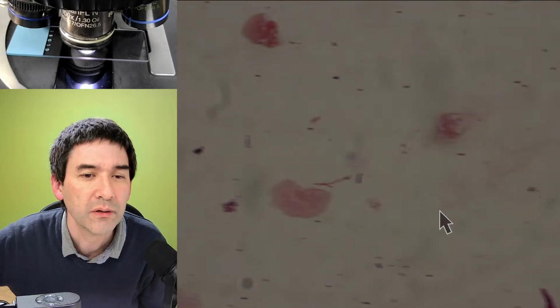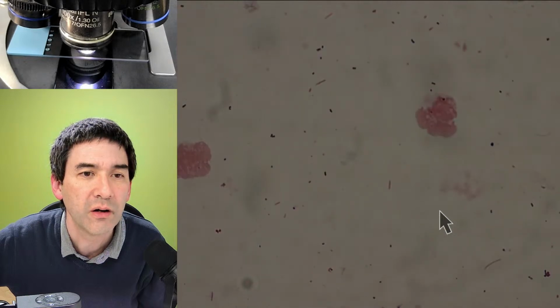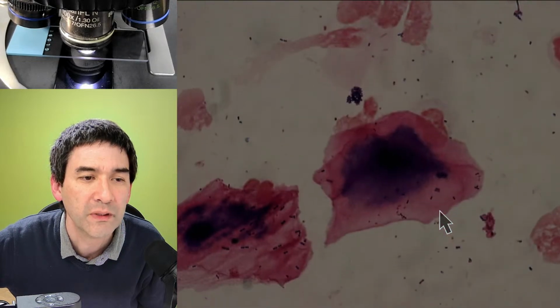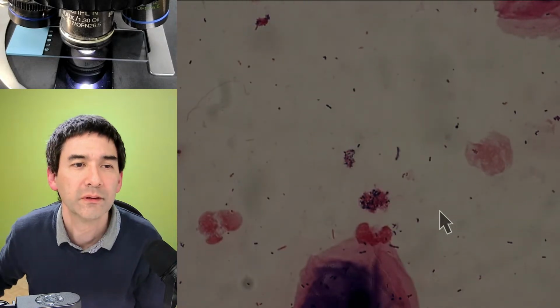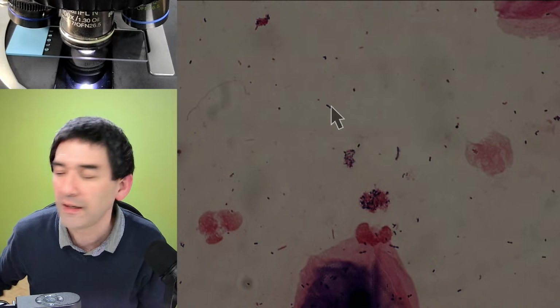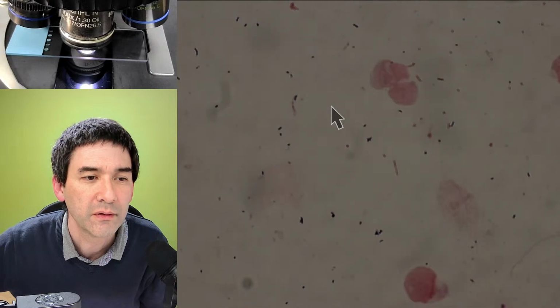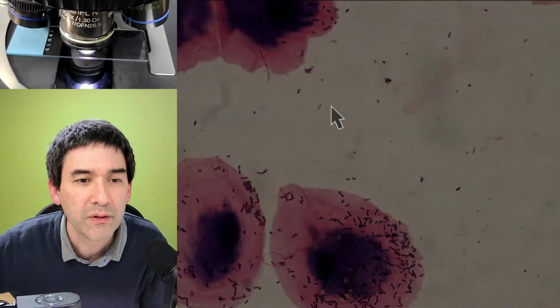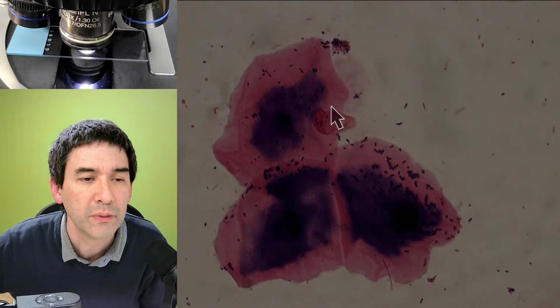So let's have a look here. Yeah, definitely. These red patches here are the epithelial cells. Here, this one did not completely destain the black. But look at the bacteria here, right? Rod-shaped bacteria. They are now nicely visible. So these are all bacteria of my mouth. And these are the cells that did not completely destain.